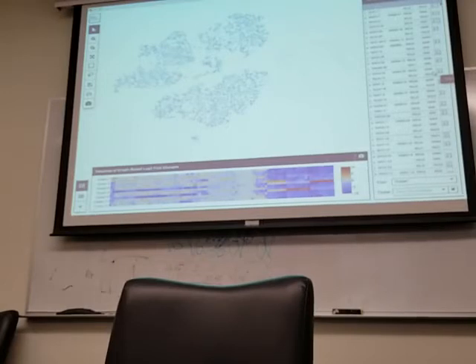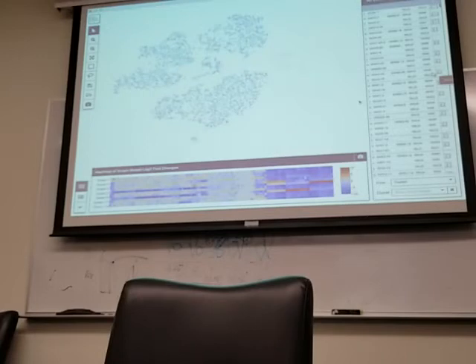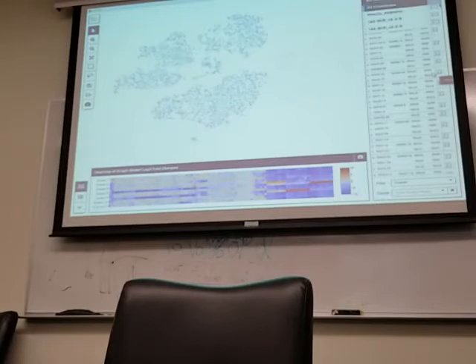You can do V's, but that's one individual, and that individual has some characteristic, some bias in V gene usage or some clonality profile or something like that. That tells you for that individual. In the same individual, we do find this patient has a very high neural signature, but within the same individual, there are B cells which don't have that signature. Yes, so then to answer it, to compare them.